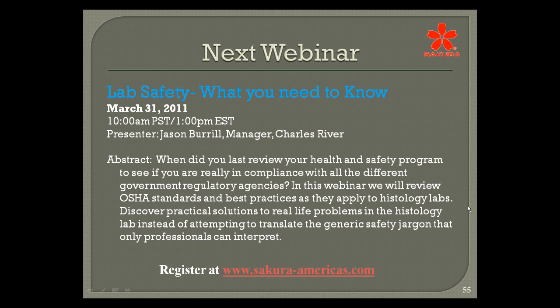Thank you, Lamar. Second question is, do you have any problems with the small 1 millimeter cores washing off the slides during IHC procedures? I haven't. However, we have not really used very many of the smaller punches. I didn't talk about this in the presentation, but there is a sectioning device that I know many people do use for the smaller cores, such as the one you described. It's known as the tape device. Although I'll be honest, I've never really used it.